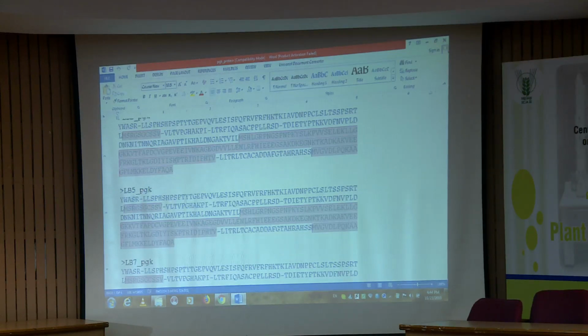You can put all samples with one gene in a single file. If 10-20 samples are there with a single gene with the same region amplified, you can annotate and put them in a single file, and every piece of information you can add to that format, and it will generate a flat file.